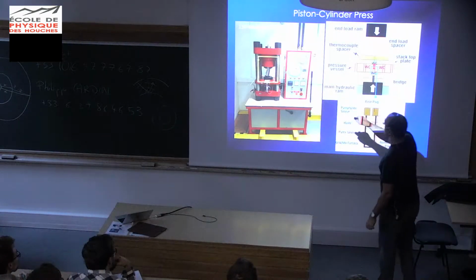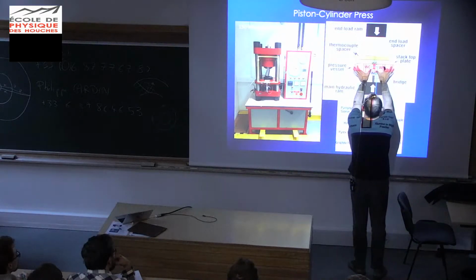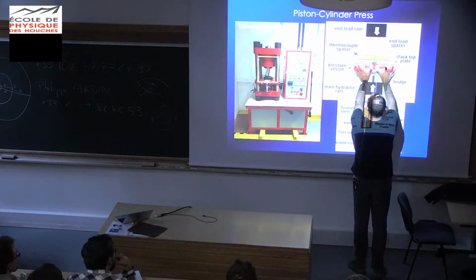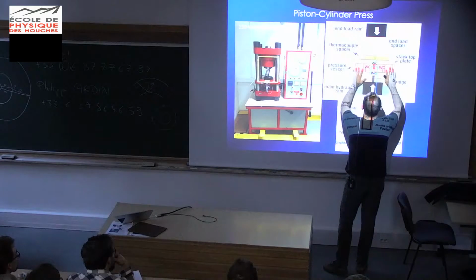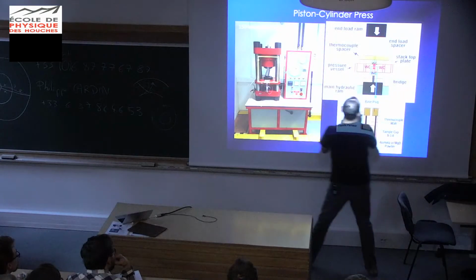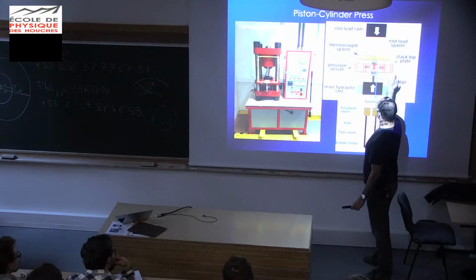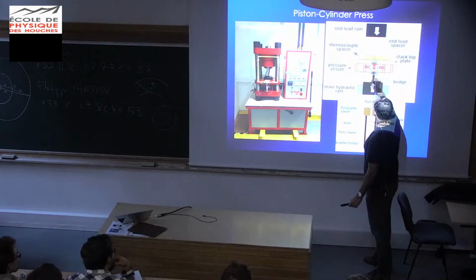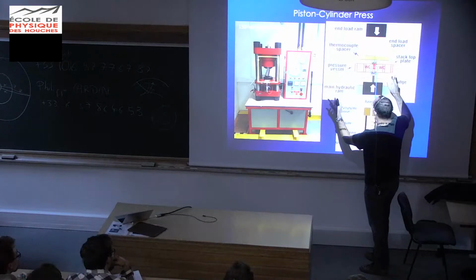So let's focus on this part here, which is blown up here. You have this big anvil. It's not an anvil. What do you call this thing? It's a vessel. So it's a big tungsten carbide and steel vessel that sits here, and you have a tungsten carbide ram that goes in a little. So this is all axisymmetric, okay? Everything is cylindrical. That goes in this, and that's being pushed by one ram, and you have another ram that pushes on the whole system. All right? So you have 2 independent rams.